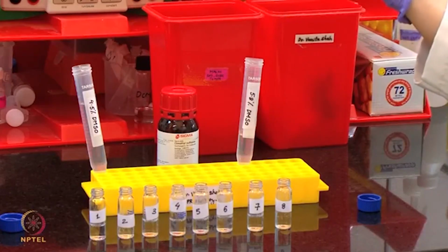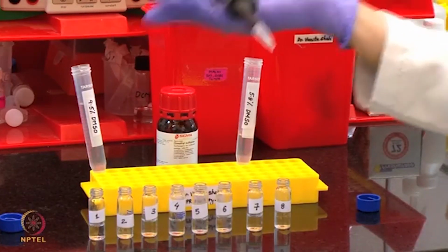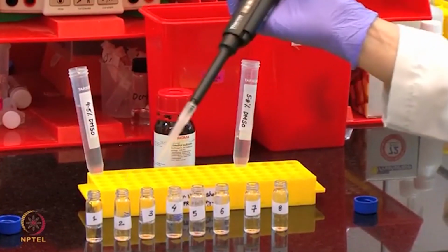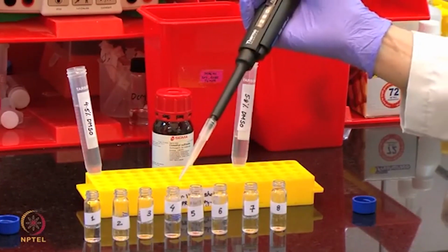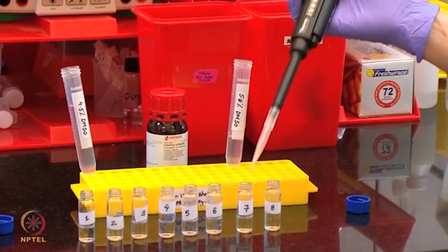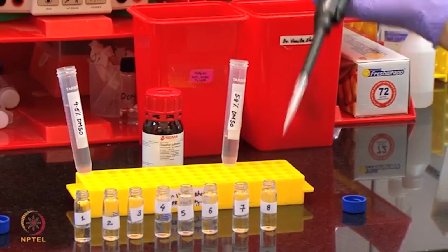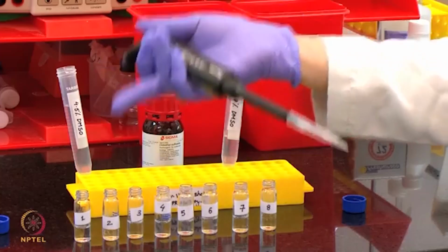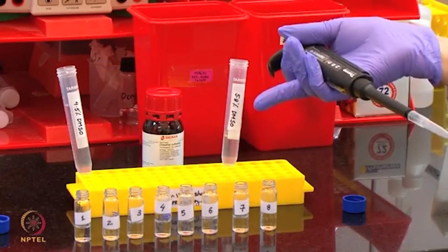To reiterate, we have numbered the tubes as 1 to 8 and added 200, 400, 600, 800, 1000, 1200 and 1400 microliter of 4.5% DMSO in tubes 2 to 8 respectively.